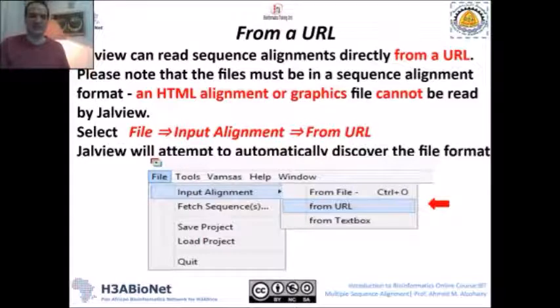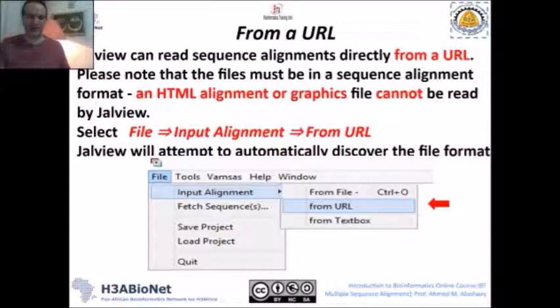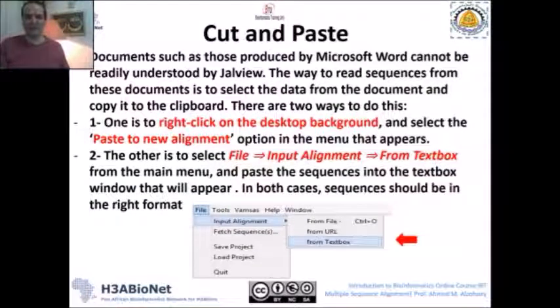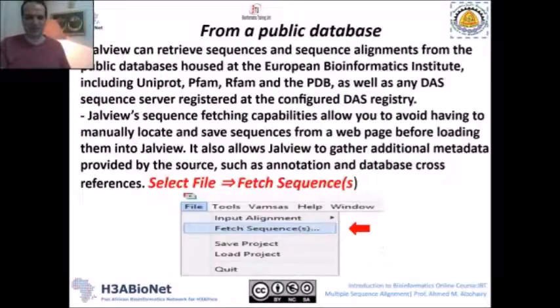The second option is From URL: when you press this option, you simply enter the URL that contains your sequences — whether it's an HTML alignment, a graphic, or whatever format. The third option is From Textbox, which allows you to copy and paste your sequence in FASTA format or any recognizable format for JalView into the text box that appears when you press this option.